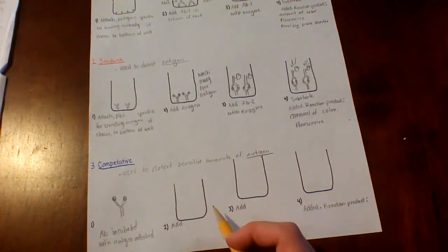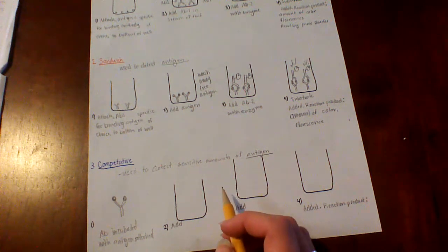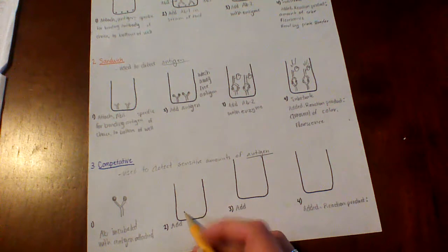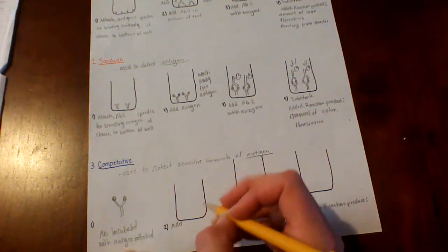So the more antigen that's available in this step, the less free antibodies there are to bind in step 2.